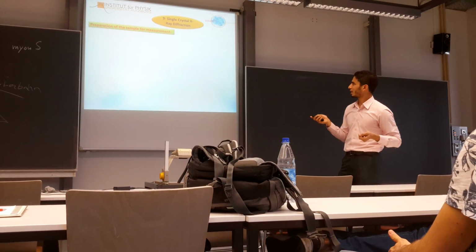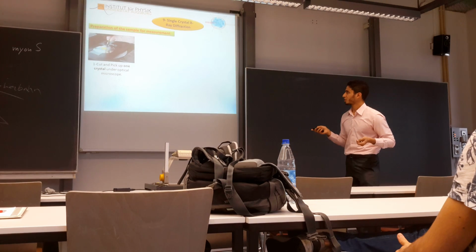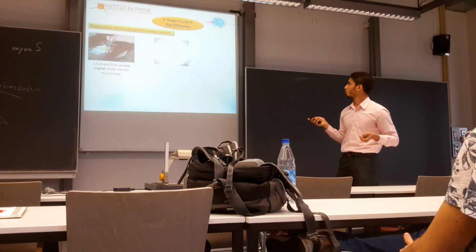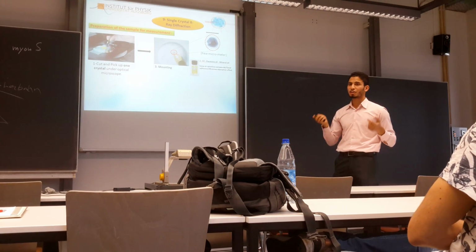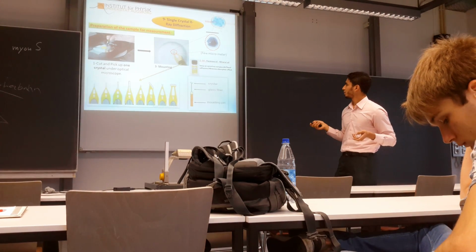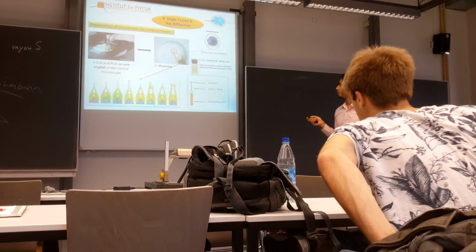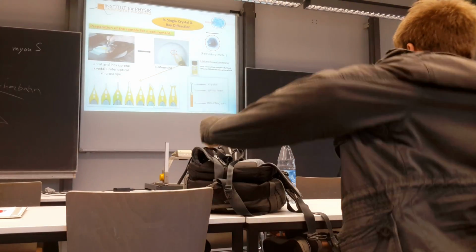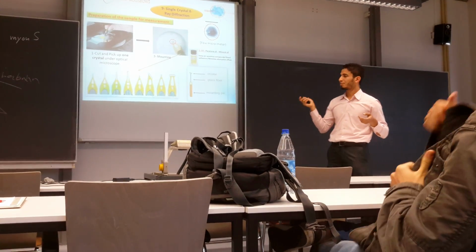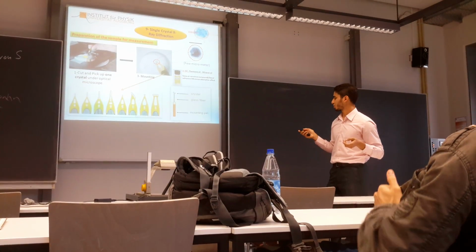So I'm going to introduce only the preparation of the sample for measurement. In case of single crystal X-ray diffraction, first of all, we should cut and select one crystal under optical microscope, and we should select this crystal according to special criteria. The dimensions of this crystal depend on the size of the mounting you choose for measurement. And you should use some type of oil, because this prevents any reaction between the material and the air, enhances adhesion with the mounting, and minimizes the absorption effect.